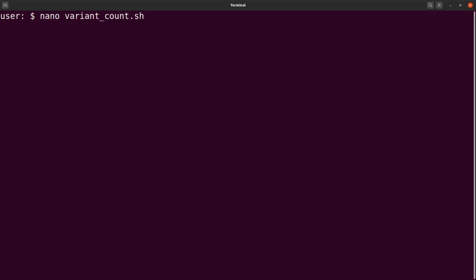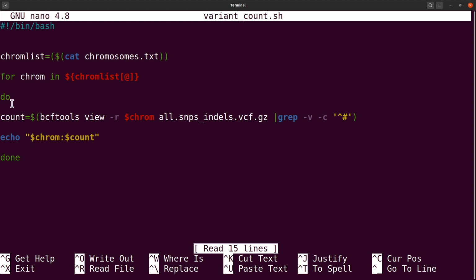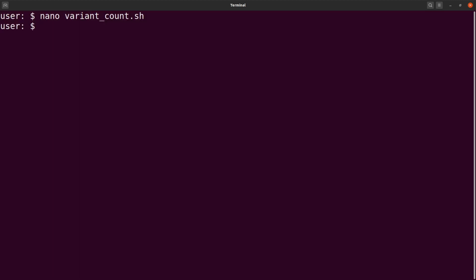If you compare, here we have 1, 2, 3, 4, 5, 6, 7, just 7 lines. And it has been able to do the activity for us, and it's much better than having to repeat the commands 24 times. Okay, this is much simpler, efficient, and it's also very flexible because of the loops here. So this is how we use scripts to automate some of the bioinformatics activities we do, especially if we are processing large amounts of files. So just take note of that.